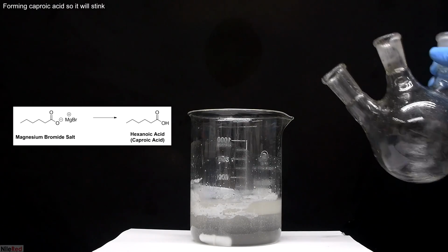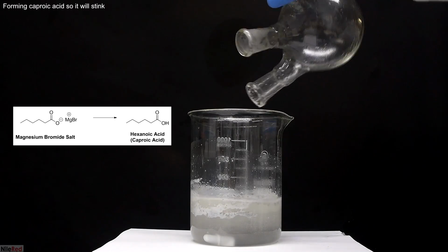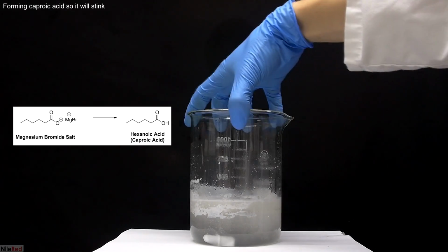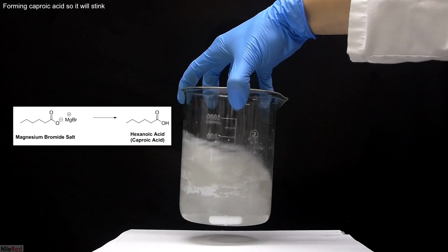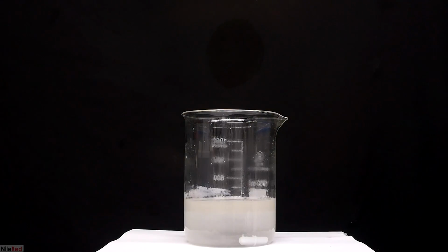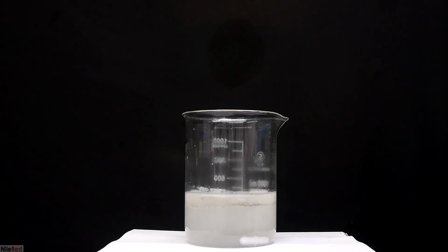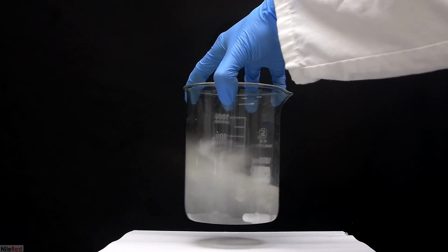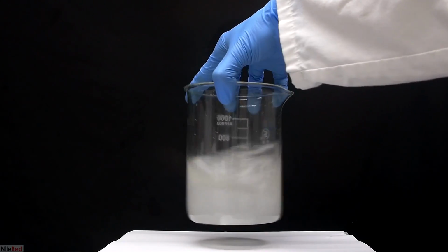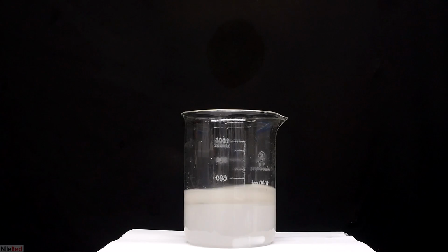The addition of the acid also has a secondary purpose, and this is to get rid of any magnesium that might be left over. In general, Grignard reactions use an excess of magnesium, so it's pretty much expected to have some left over at the end. After all of the washing steps are done, I just add in the rest of the 10% hydrochloric acid solution. I mix it around a little and let it stand, and the last little bit of unhydrolyzed salt disappears.